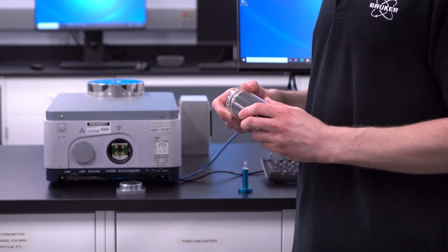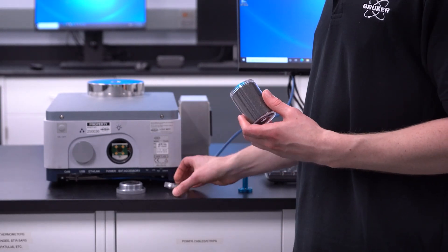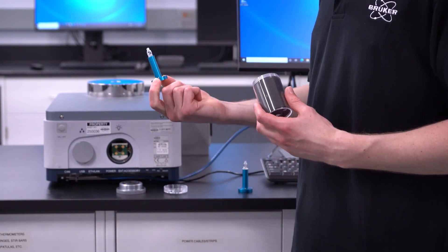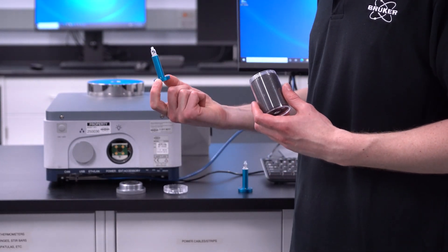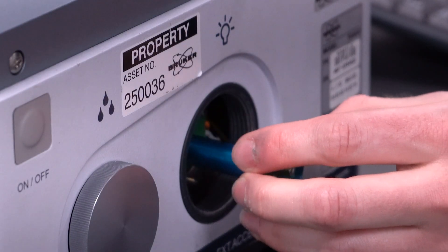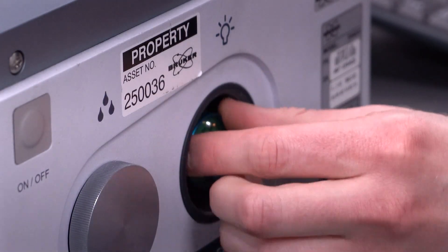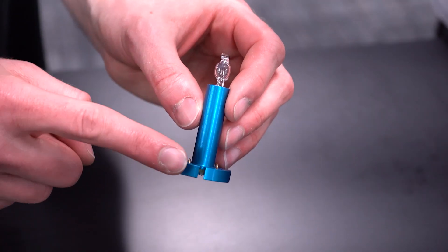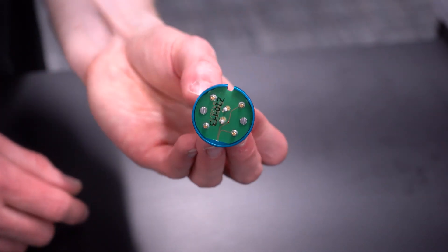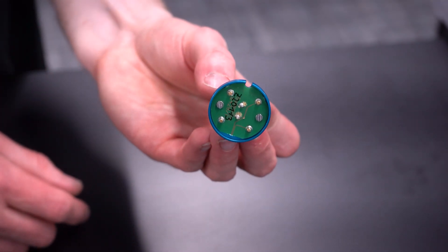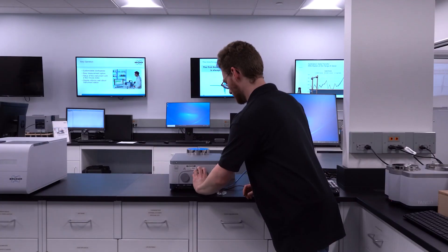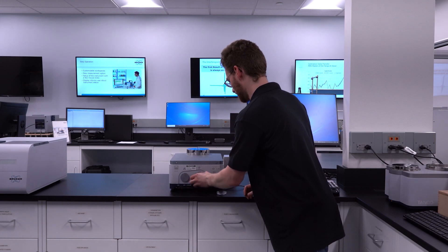Our light source comes in a single piece, which makes it easy to install. The light source is as simple to replace as inserting the light source. There's a notch that prevents you from putting it in incorrectly, and then all you have to do is screw on the cap.